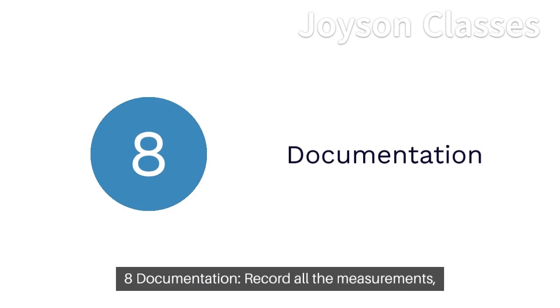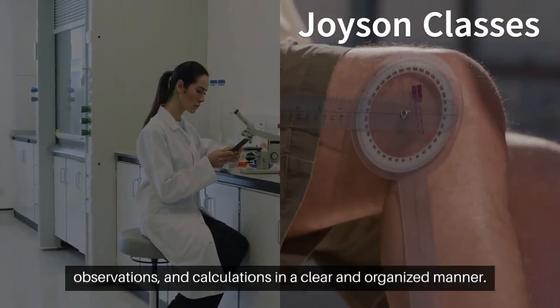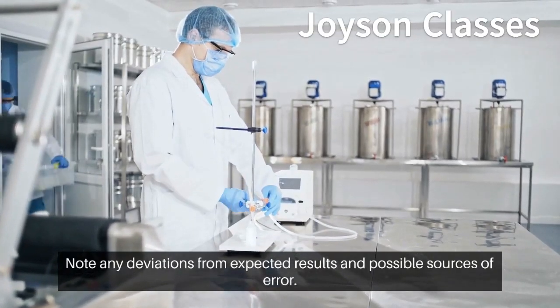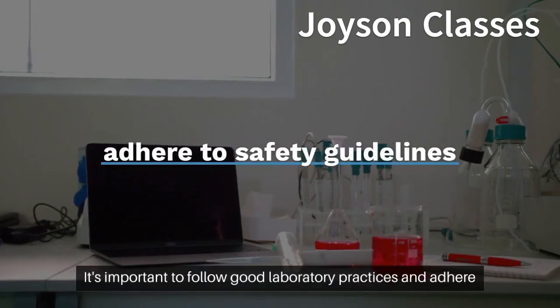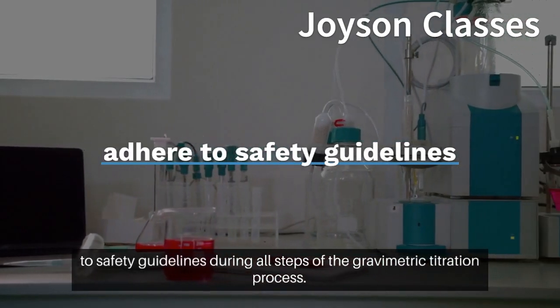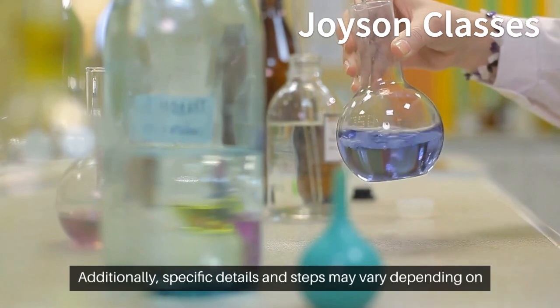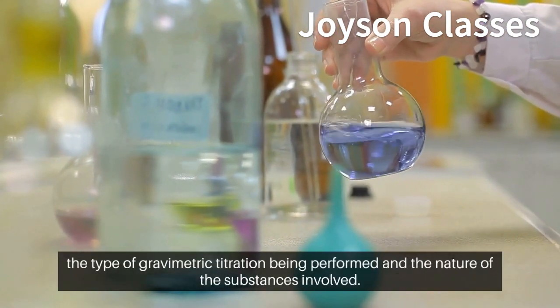8. Documentation. Record all the measurements, observations, and calculations in a clear and organized manner. Note any deviations from expected results and possible sources of error. It's important to follow good laboratory practices and adhere to safety guidelines during all steps of the gravimetric titration process. Additionally, specific details and steps may vary depending on the type of gravimetric titration being performed and the nature of the substances involved.